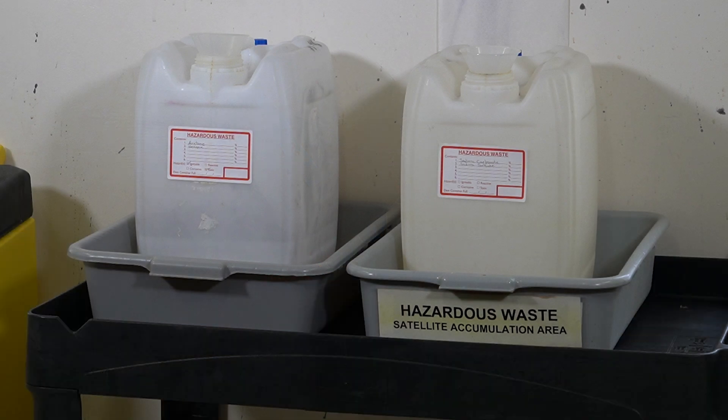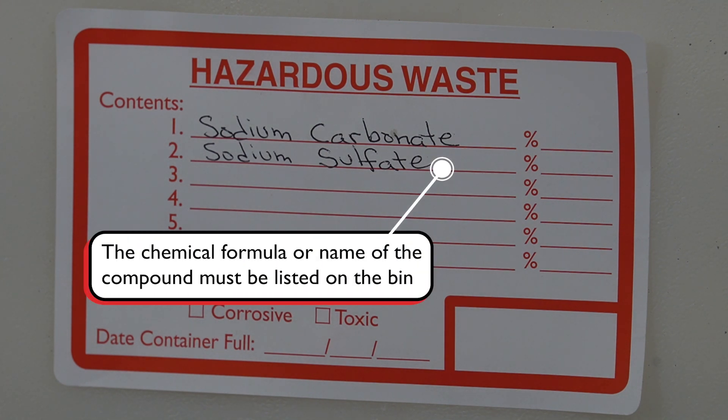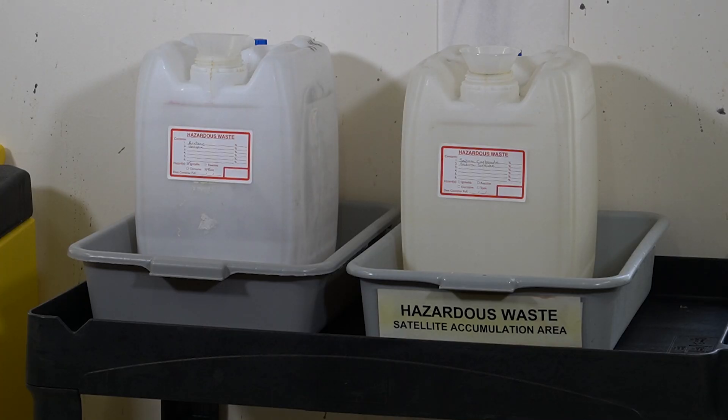In addition to the waste beaker, the large waste container must also be labeled. This label is usually prepared by the lab manager, with the chemical formula of each compound in the waste clearly listed. When emptying your own waste beaker into the large waste bin, you must always read the label first. You do not want to mix incompatible wastes and cause a bad reaction.